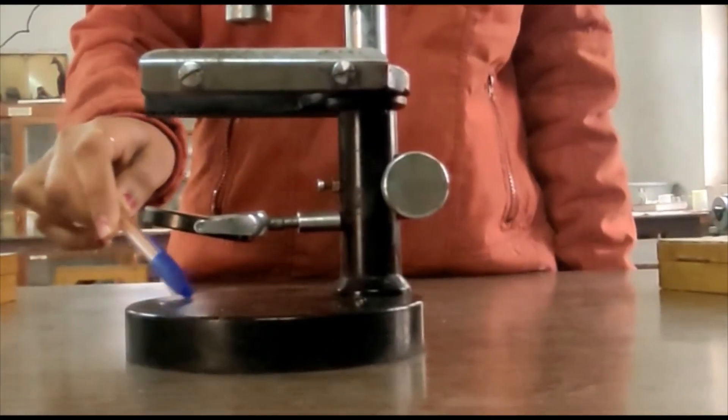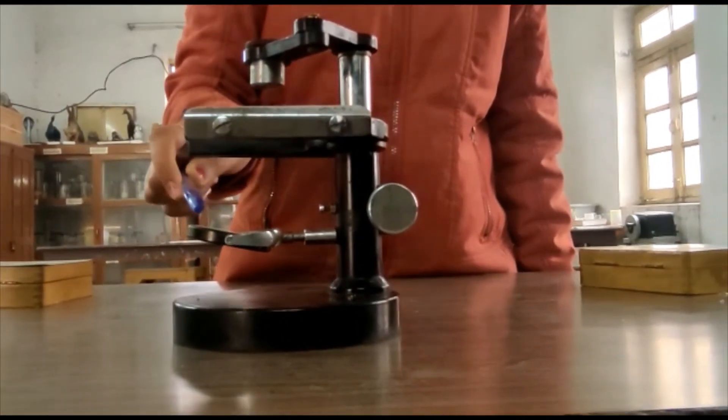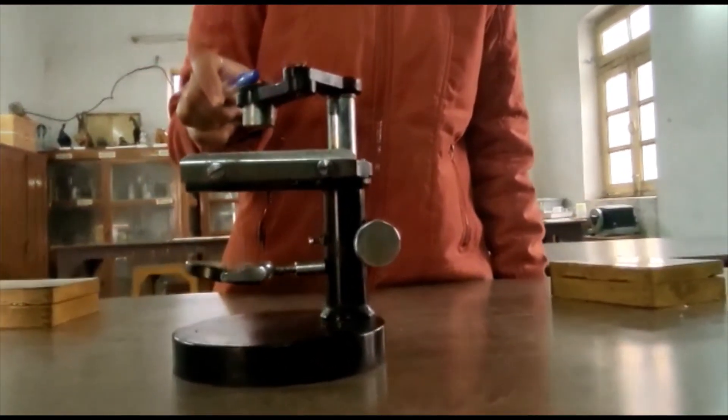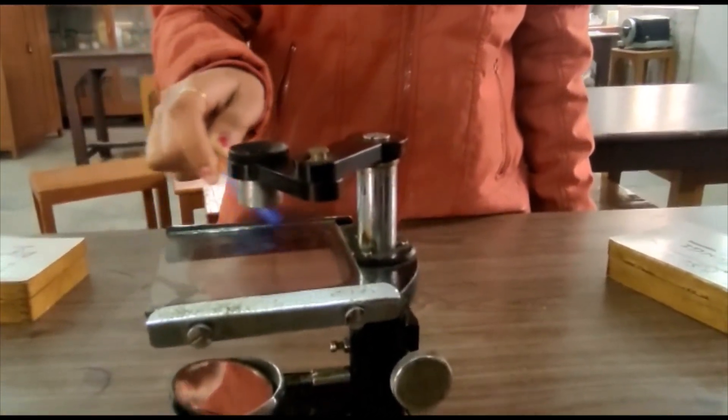Now next is the dissecting microscope. This is the basal part, here it is adjustment screw. This is the mirror, this is ocular lens and this is the stage. Here this is the slide.